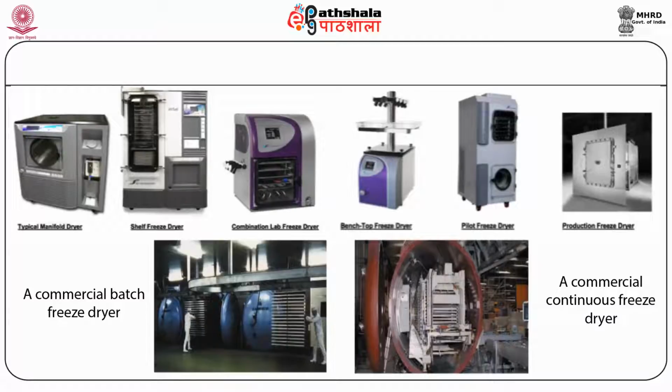So in general, we have to use the freeze dryer depending on the type of product or nature of the product, including the composition, and most importantly the physical nature of the product.